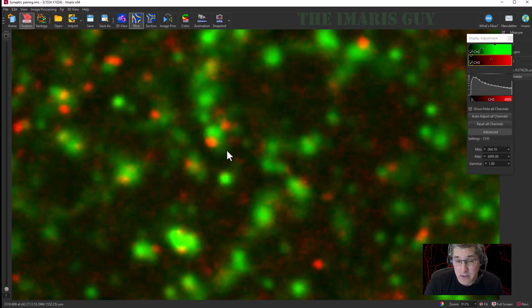So not just looking at the number of red spots colocalized with green spots, which is very useful and very powerful, but also taking it to another level and seeing if there's a little bit of other structure within this type of analysis after we do the segmentation, to further the analysis of the synaptic organization, the presynaptic and postsynaptic, or any 2 puncta that are 2 different structures where you're looking for those relationships between each other. And so synaptic puncta, whether they're PSD95 or V-glut or glutamate receptors, or any structure that labels in this punctate manner, is really going to benefit from this particular extension.